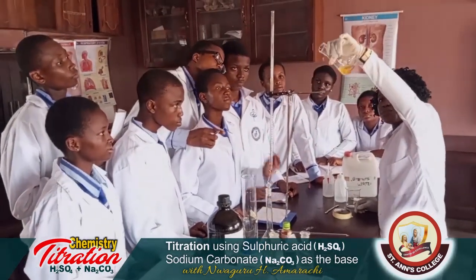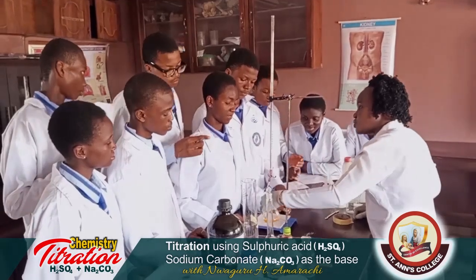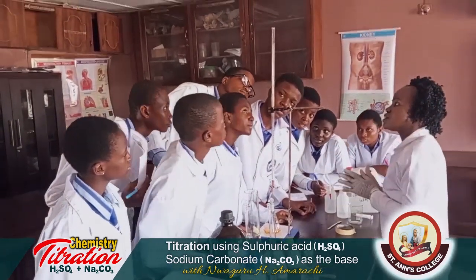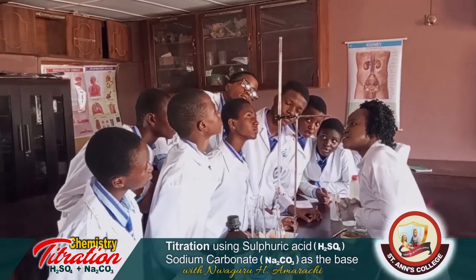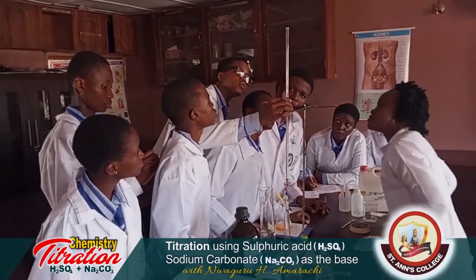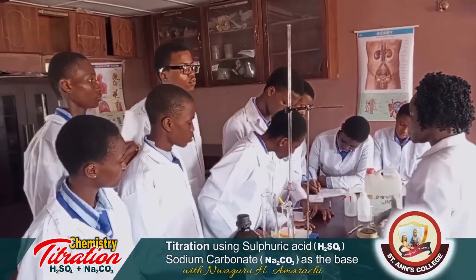Now we have a visible color change. So what's the value? 18 point what? 18.80. Okay, 18.80. Good.